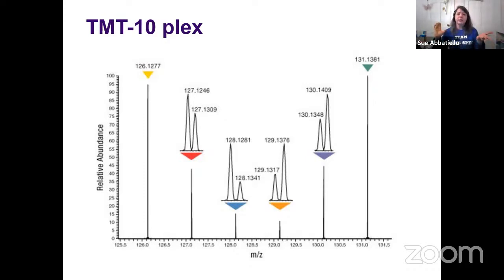The TMT reagents are expensive. If you're doing a 1 versus 1 experiment, you can achieve that by doing label-free, at just the cost of the LCMS analysis, whereas the reagents are expensive, or could be in the thousands of dollars. So if you buy a kit and you're analyzing 10 samples, now, yes, you are saving on runtime by combining all your samples together. So there is a portion of experimental design consideration based on your budget and then your LCMS availability.